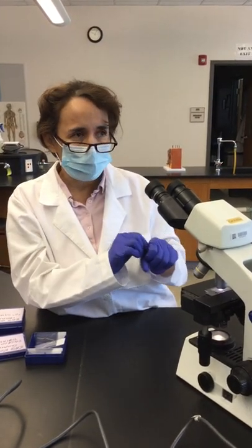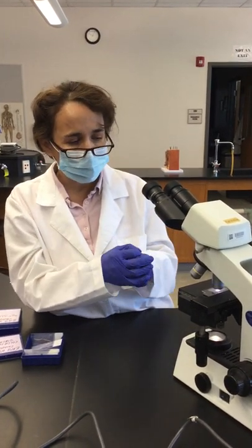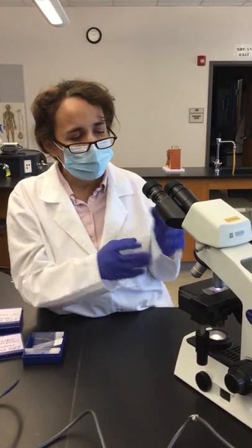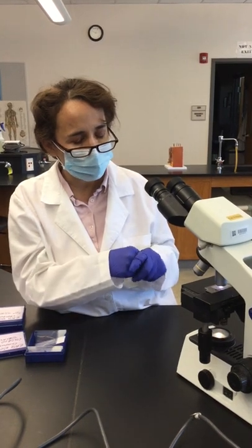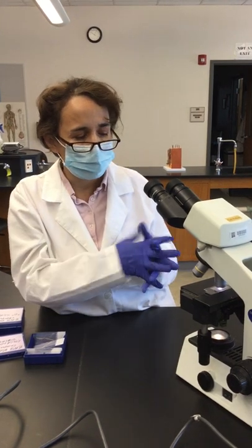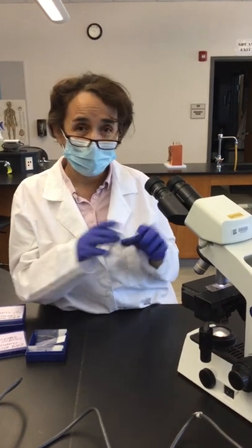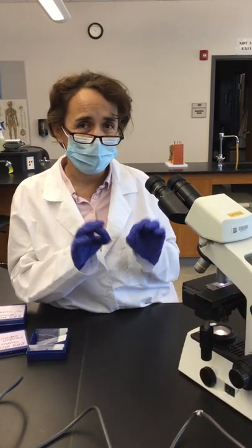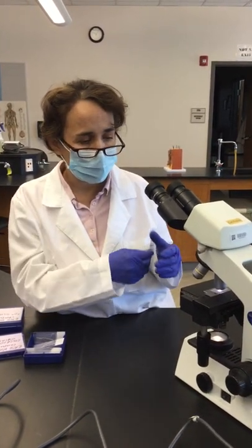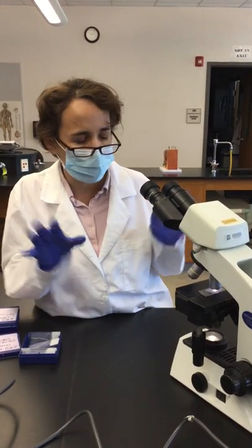Once you use the oil immersion objective, clean it with the special objective lens paper. Do not use that same paper to clean the other objective lenses, because you'll contaminate them with oil. Over time oil dries on the lens surface and becomes very hard to remove. Using a solvent like alcohol can detach the glue holding the lens. Occasionally alcohol wipes are used, but lens paper is preferred. Never use paper towels, Kleenex, or anything else — the objective lens tissue is very specialized and expensive.